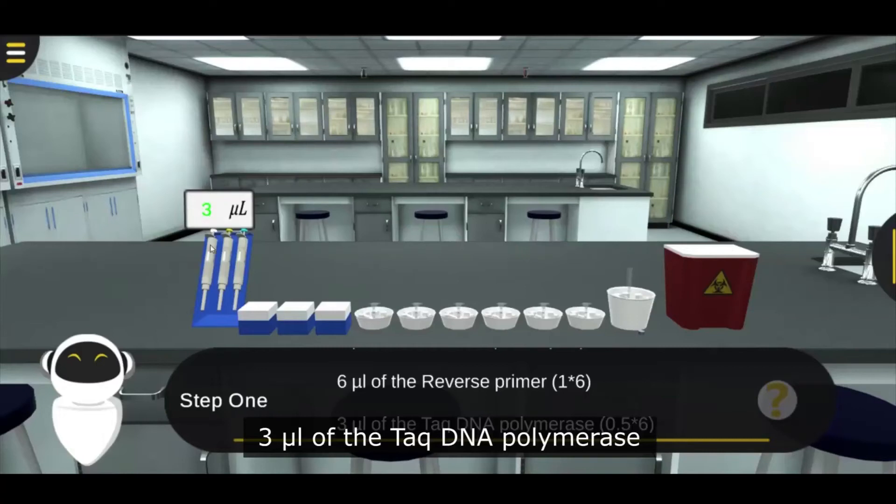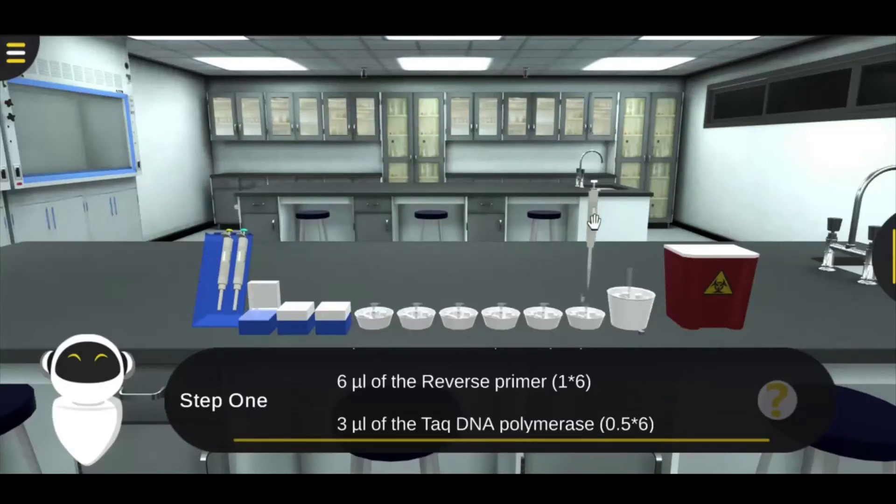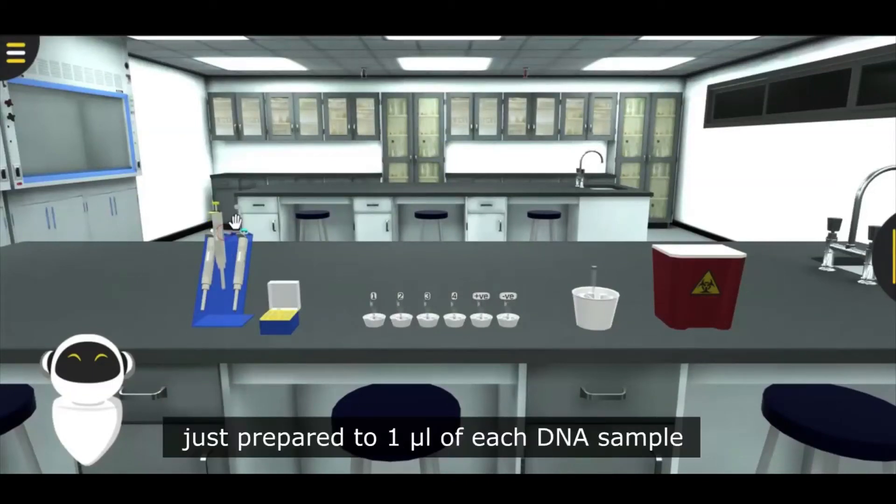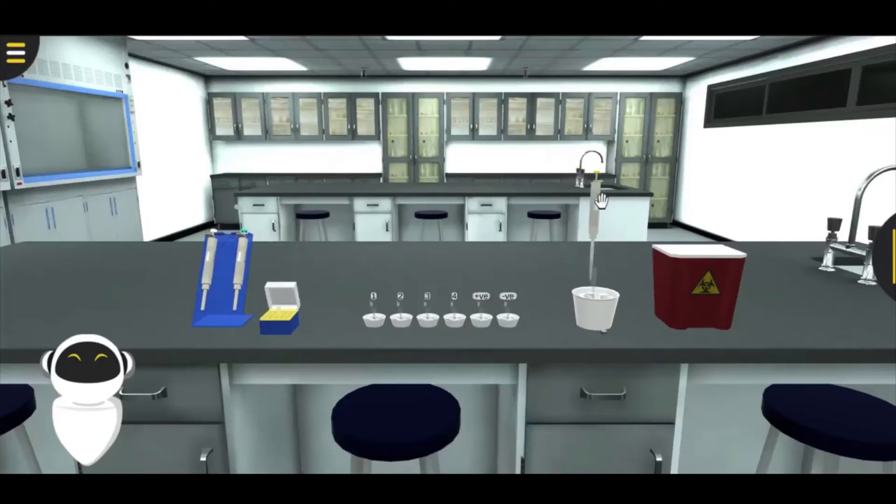Add 3 microliters of the Taq DNA polymerase.